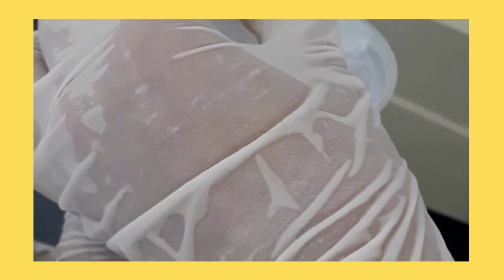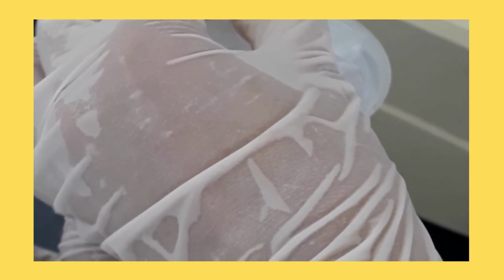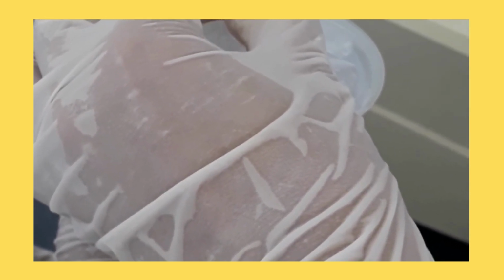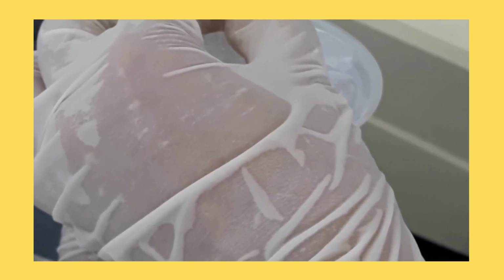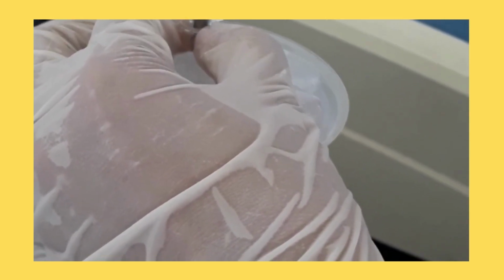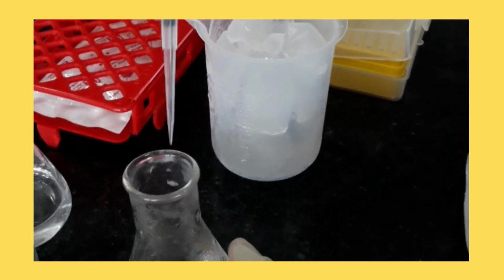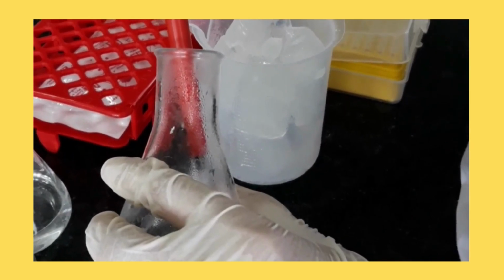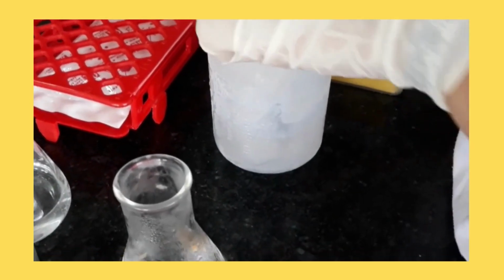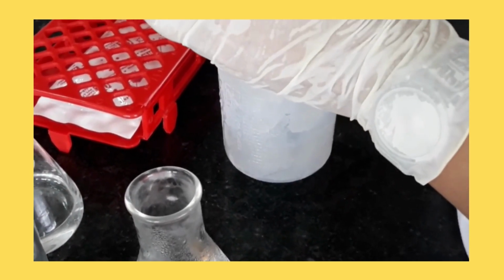Homogenize the tissue with the help of a mixer. For phase separation, we add 0.2 ml of chloroform per 1 ml of TRIzol, and after that we invert the tubes for 15 seconds.